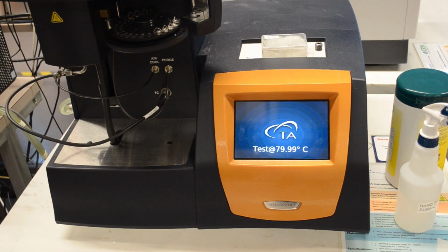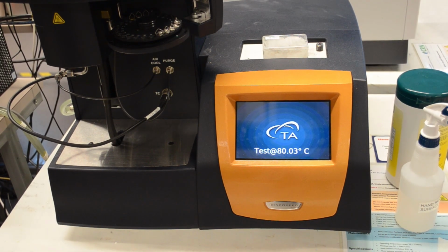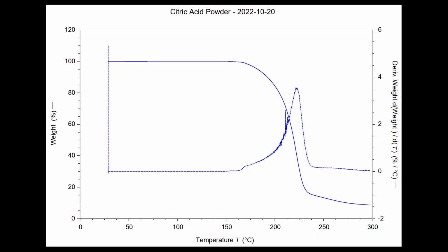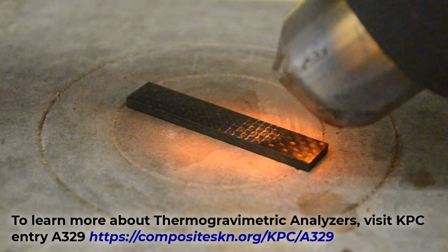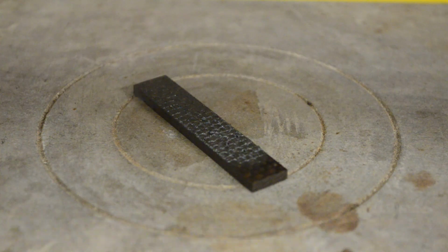Measurements taken after the sample has degraded will not help us determine the Tg and can potentially soil the DMA. The degradation temperature of a material can be determined with a thermogravimetric analyzer, or a TGA. A TGA will measure the mass of a small sample while its temperature is increased. As the material starts to degrade at high temperatures, it will typically begin to lose mass. Solid molecules react with ambient gases, each other, and themselves to produce smaller gas molecules. The results of this test can be used to determine a temperature for the upper limit of a DMA run.